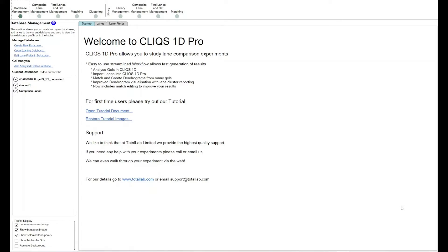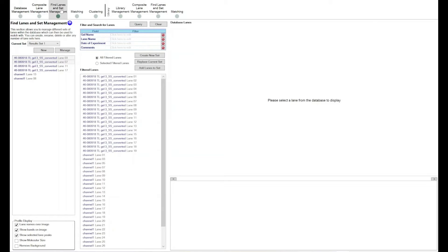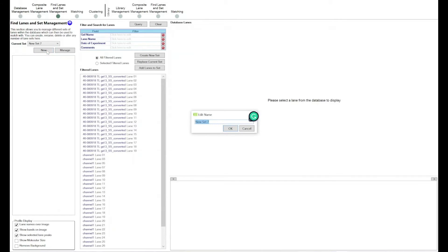I've already got a database set up here with a couple of gel blot images in. If you want to do these kinds of comparisons, you want to put the lanes you want to compare into a set of their own. Come through to the 'Find Lanes and Set Management' tab at the top and create a new set. A set of lanes is exactly what it sounds like — it's a group of lanes, a subset of your main database.